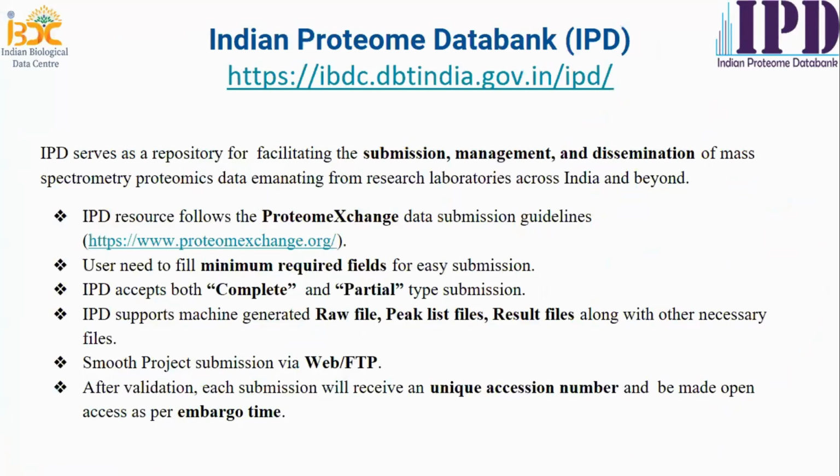So where we stand means what is the role of the IPD? IPD serves as a repository for facilitating the submission, management, and dissemination of mass spectrometry data, which is generated across the lab and beyond, in India and beyond. IPD was developed as per the guidelines from the ProteomeXchange data submission policies.